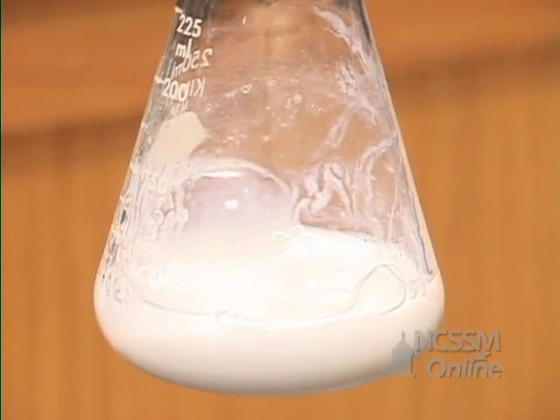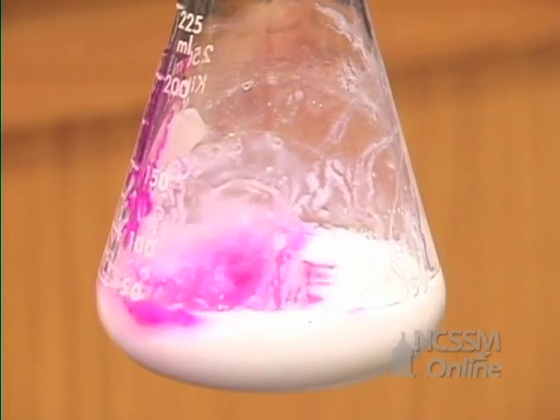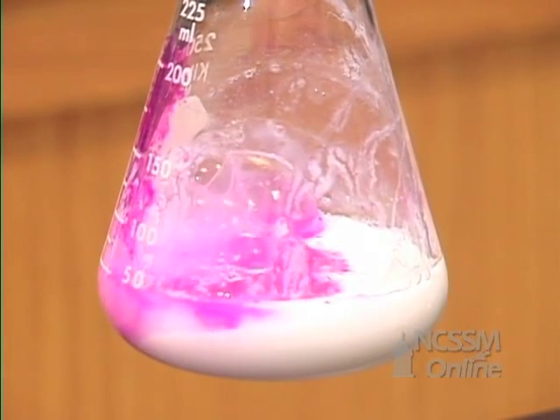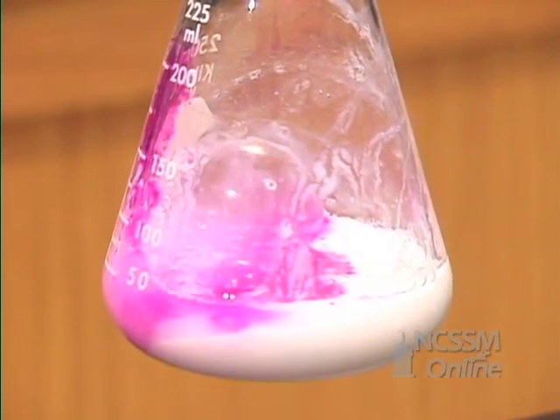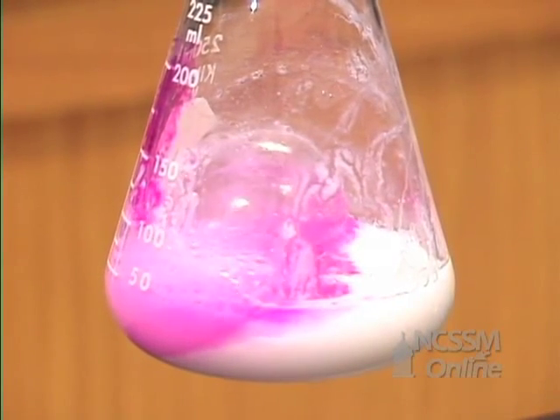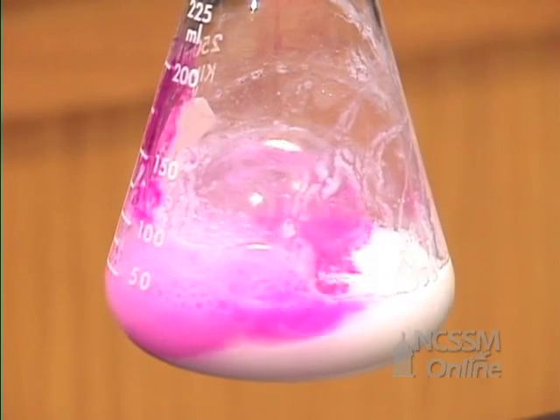We can test for the fact that calcium hydroxide is produced by adding phenolphthalein. The phenolphthalein is colorless in acid solution and pink in basic solution. The fact that the phenolphthalein turns pink tells us that we have produced the metal hydroxide.